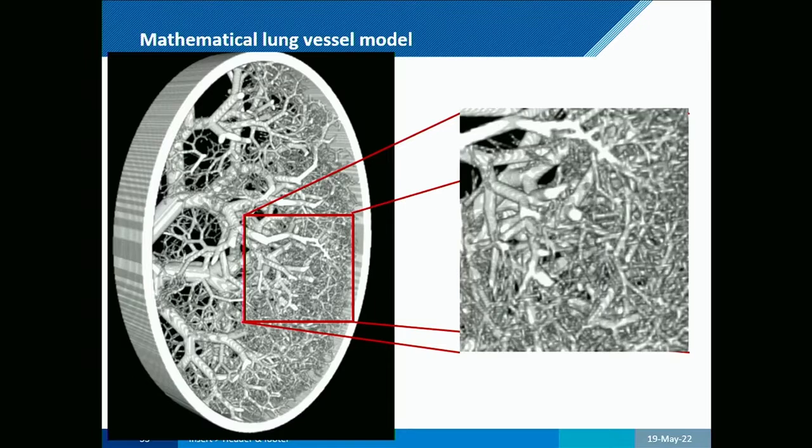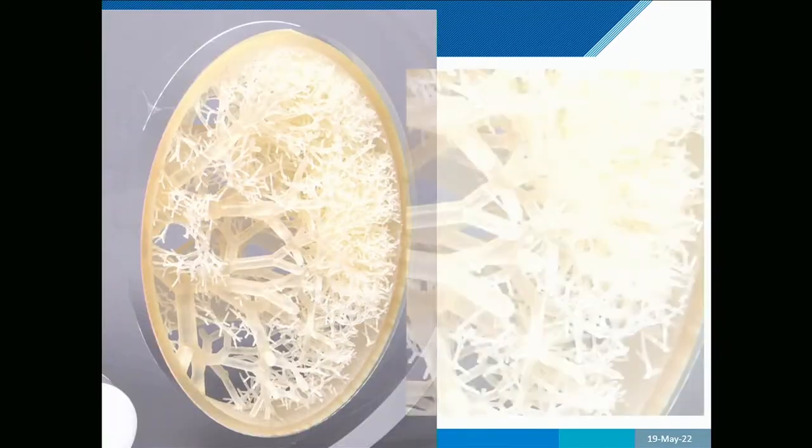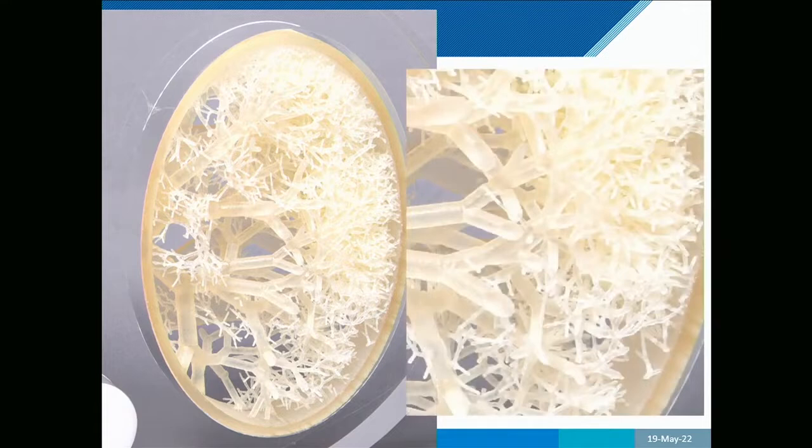If you want to see it in more detail, here is a zoomed part. Again, this is still the mathematical model that we developed. This is what it looks like. So, a lot of vessels there. And this is the 3D printed object. And this is a zoomed-in part.